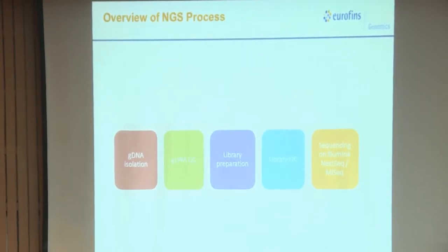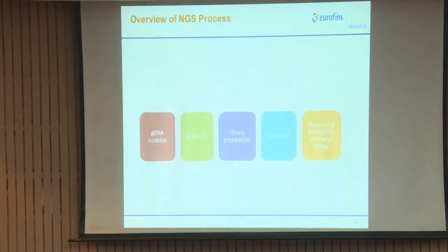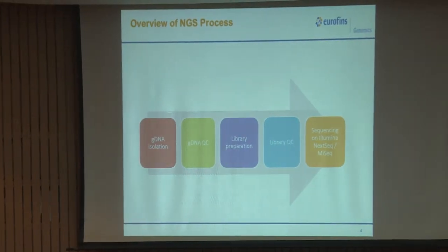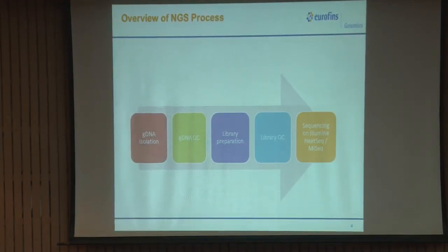Then we have library preparation. Library preparation is nothing but ligating adapters. These are components of the library kit. For example, if you are doing a sequencing on Illumina, we have the Nextera kit, and we have many other kits which are available for preparing a library, right. So, these kits have components like adapters, and these adapters are very important components which bind to your DNA template. How will your machine identify what your DNA template is, what has to be sequenced.